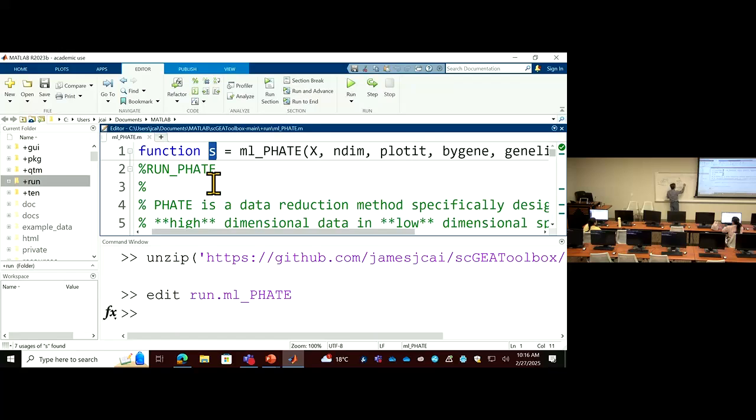From here, I can do a scatter plot because I have 3 numbers for each cell. So this will be X, Y, Z, 3 numbers as coordinates. So each cell, based on the 3 numbers, I put in this space. It will show up the result of embedding.